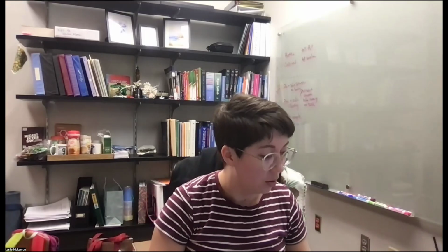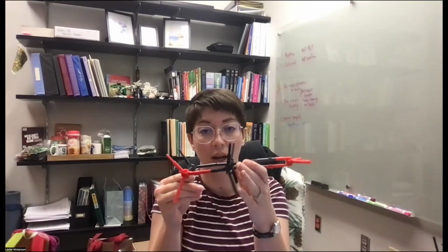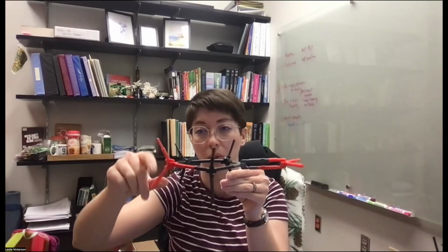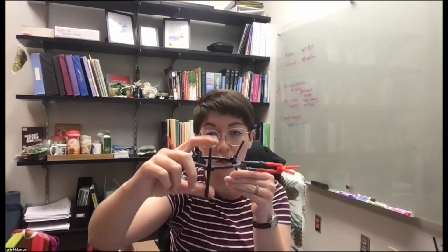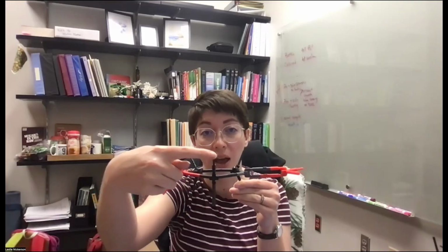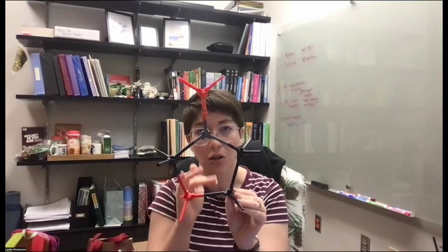So when we get to something cyclic, we can have this situation, and we actually do have a plane of symmetry right here, right? It's cutting into the plane of the molecule. So it is telling us that our two H's and two H's and two H's, that to that is the same, that to that is the same, that to that is the same. But we don't have any other planes of symmetry here in terms of the rest of the molecule. So if we look at what that looks like in two.